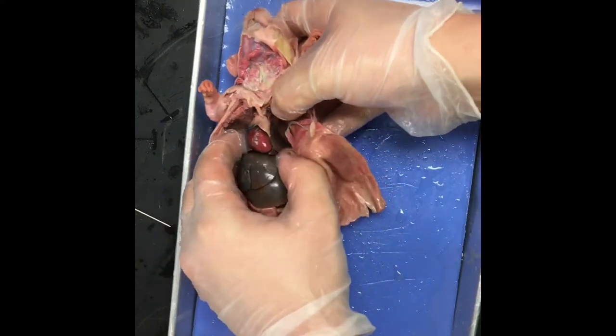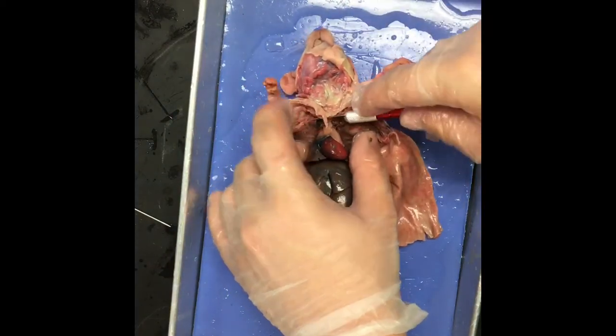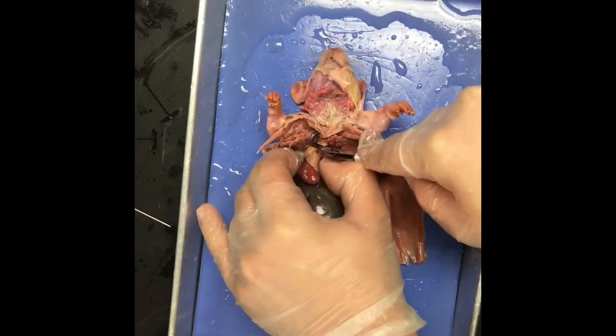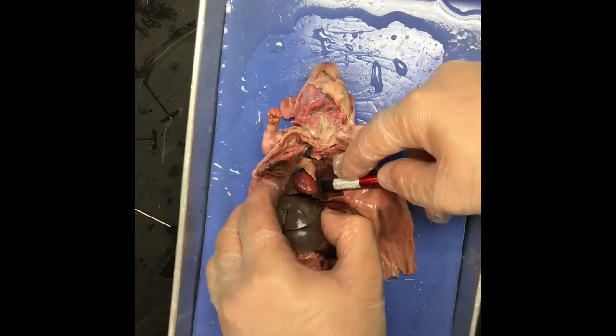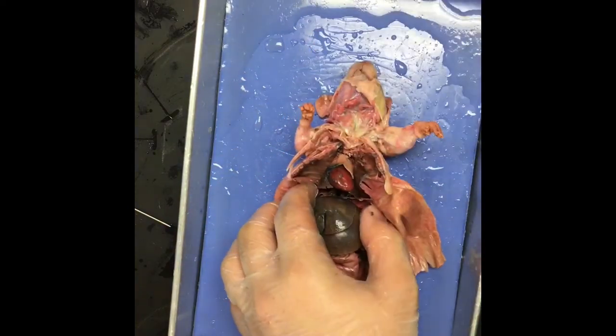All right, so this, you have your heart, that's heart and lungs. These little side pieces are the lungs. Can I take a good picture? So what you're gonna do is you're gonna come to the top here. You're just gonna go straight through. Take a picture of that. Once those are separated, you can come down a little bit. Oh, that's the spinal. I see the spinal.